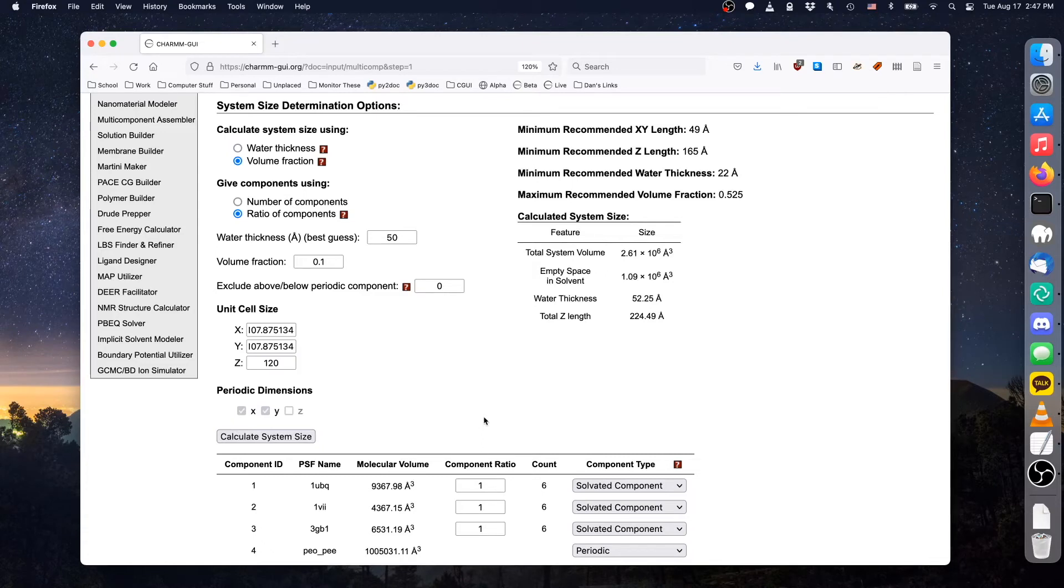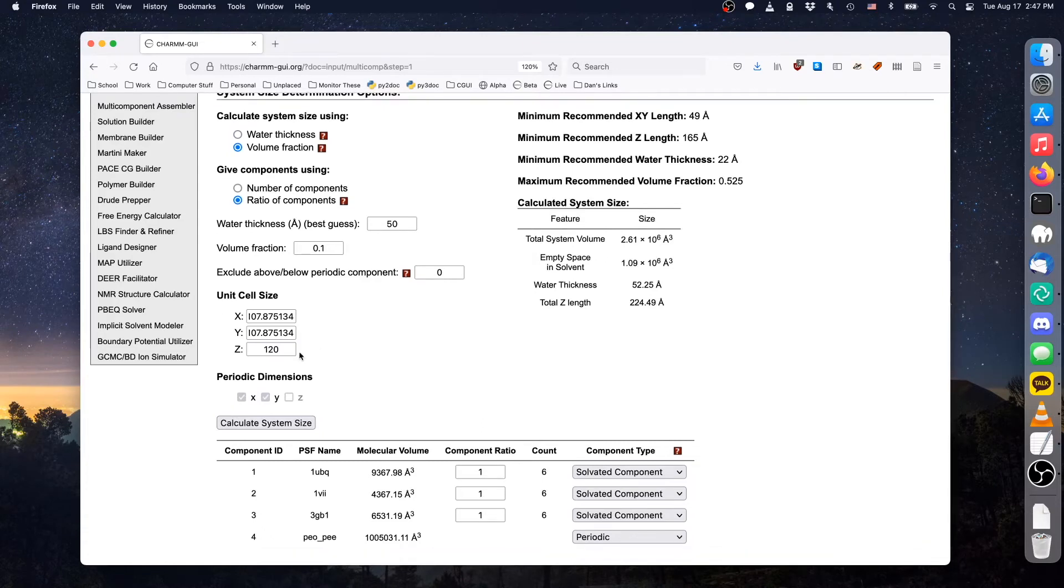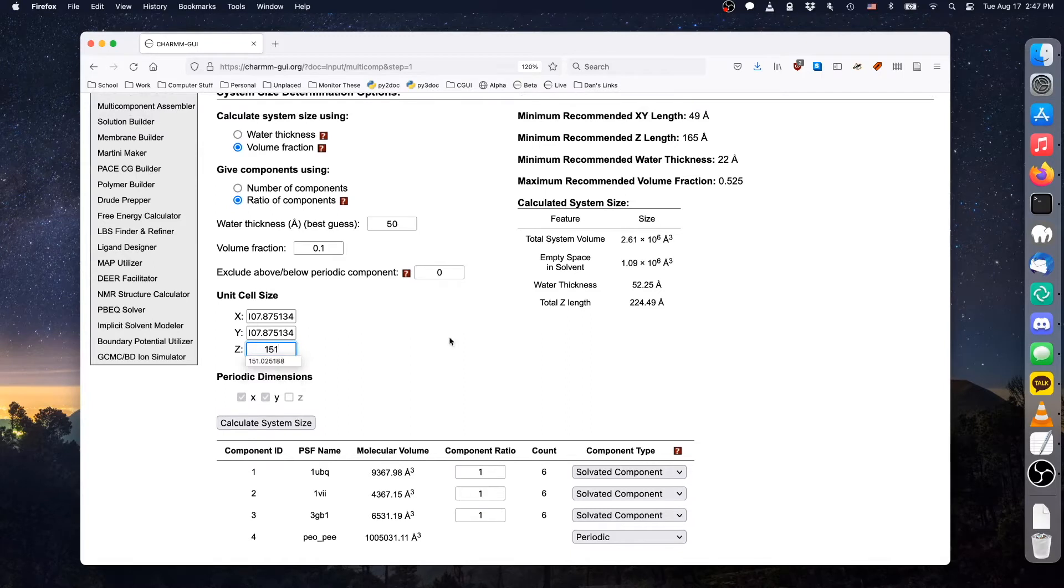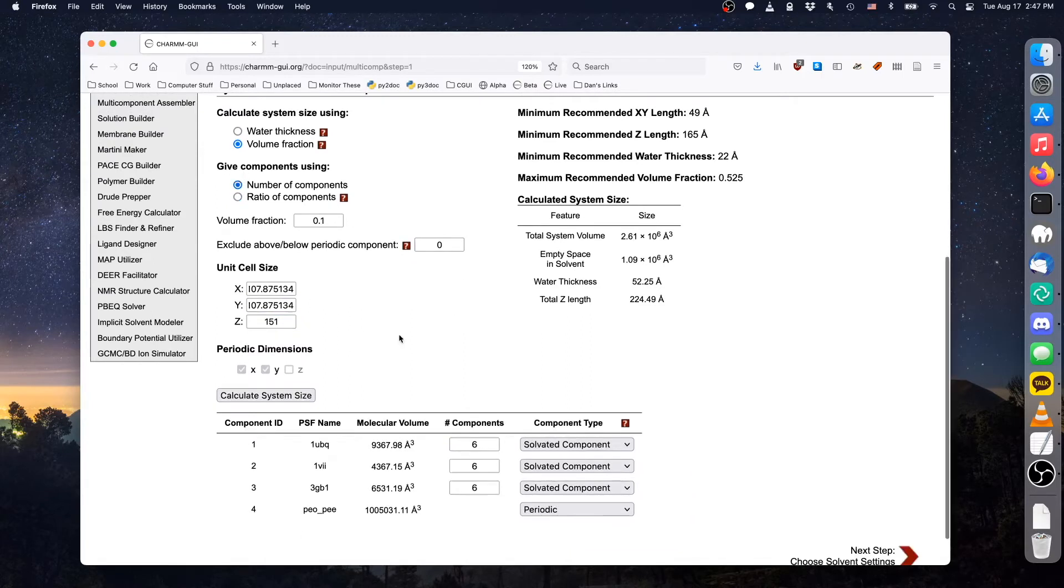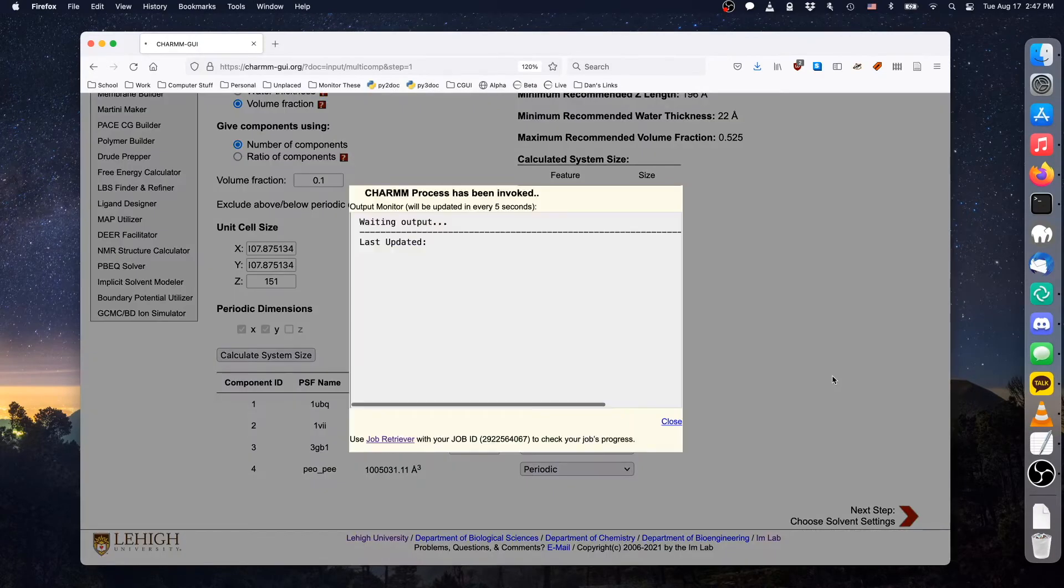However, since we uploaded a polymer with water already in it, we should return the Z value back to 151 to prevent collisions between protein and existing water. When you have determined the system size and composition, click next to generate the system.